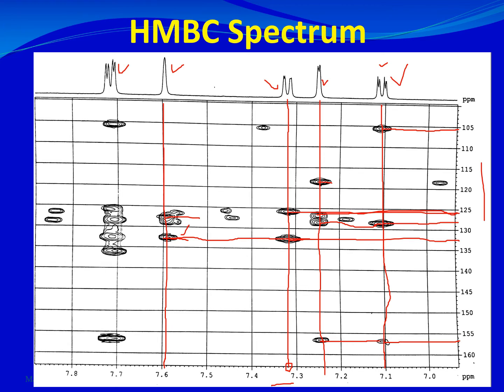This signal represents two protons — you can see two doublets. Some contours are slightly to the left and some to the right, indicating two protons showing separate correlations. The right-hand proton correlates with carbons at about 128 and 136 ppm, while the left-hand proton correlates with carbons at about 126 and 133 ppm. Additional correlations for the right-hand proton are seen at about 106 and 157 ppm.